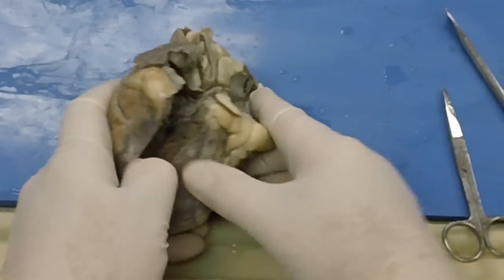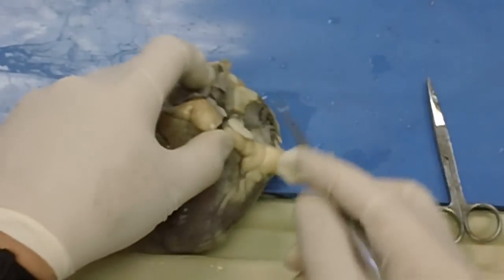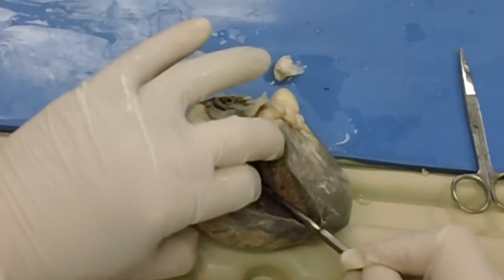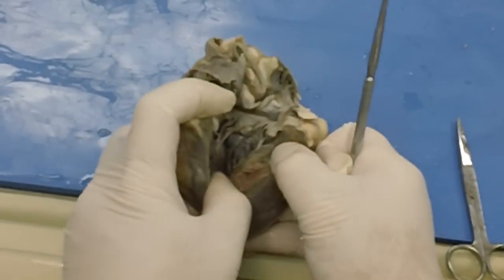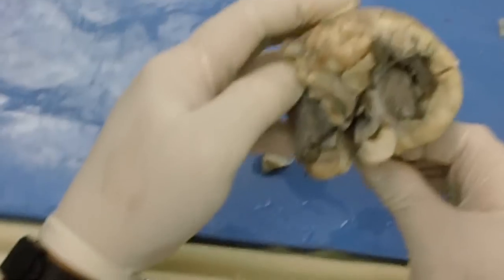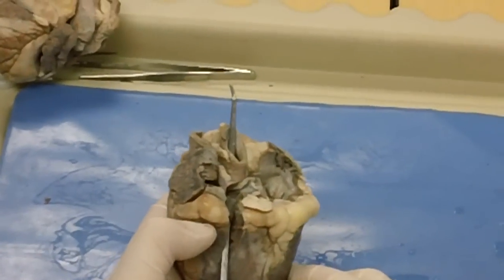Now, if I was to take this probe, we're coming in here at the left atrium, left ventricle. If I take this probe and just on the other side of the cusps of the mitral valve, I'm going to try to hold that open and come out through that vessel right there. Okay?